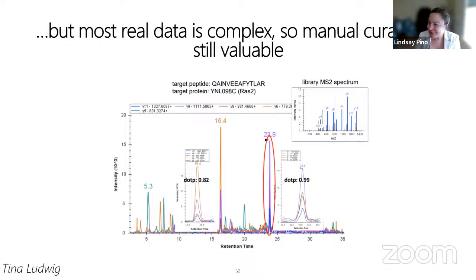I use Skyline to always look at that, but look at that data and you might find it has incorrectly identified something. Whether you're doing your own mass spectrometry for your own research or working in a core facility for a collaborator, nobody wants to waste years chasing down something that ended up being just a misprocessed signal.